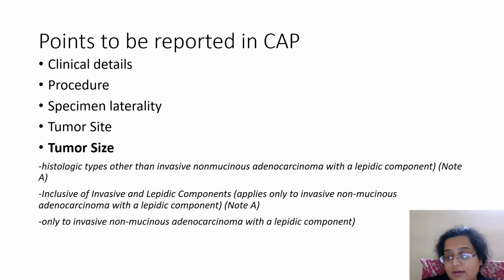When you are fixing a lung, you start from the outer curvature, the outer part of the lung, and go up to the hilum, slicing the lobe at 1 centimeter. Don't cut it throughout. Don't slice it in any haphazard direction. Maintain the orientation of the fissures and try to go parallel to them. Supposing you are taking the oblique fissure, try to go parallel to it. Don't cut in entirety. Don't detach it when you are fixing it. First go towards the hilum, trace the bronchus, etc., and push formalin in through it, so that inside also things can be fixed.